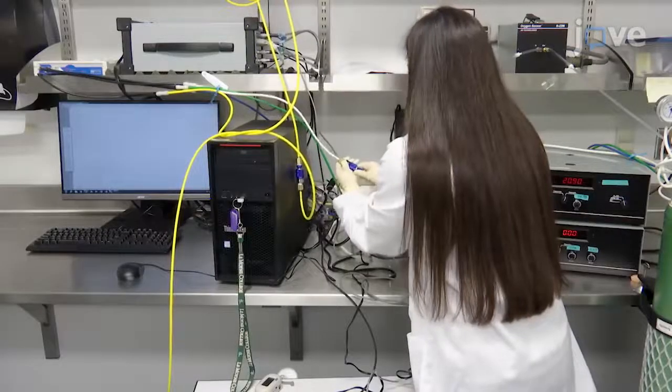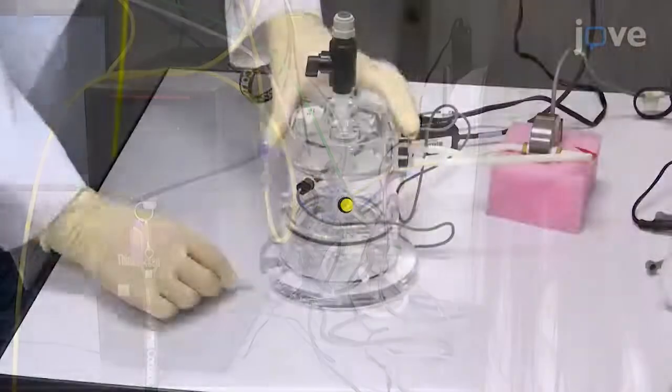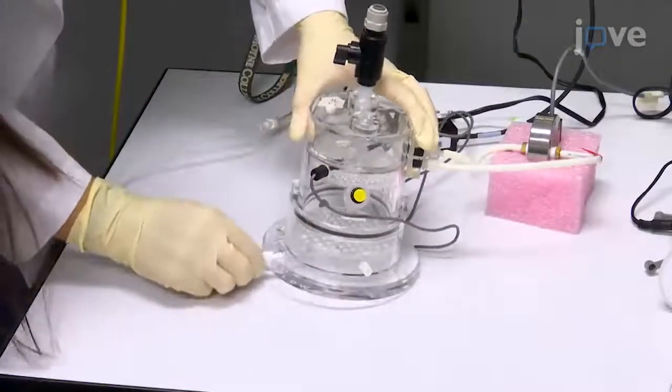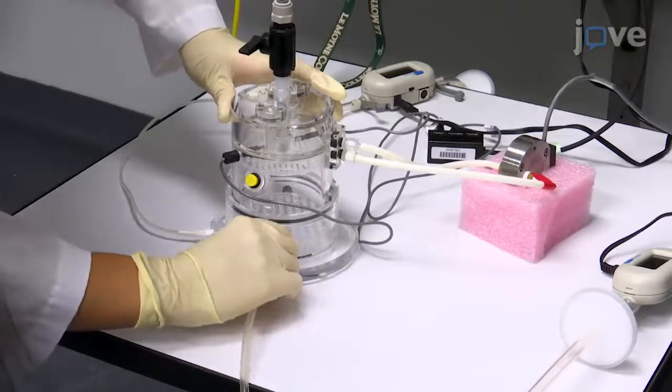Begin by making sure that all of the hoses and tubes are connected to the barometric plethysmograph chamber and by connecting a gas inflow tube and a vacuum outflow tube directly to the barometric plethysmography chamber.